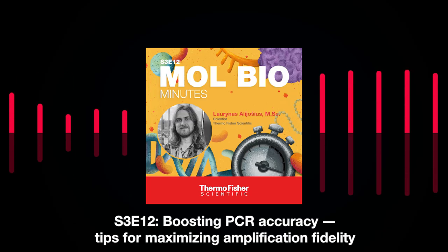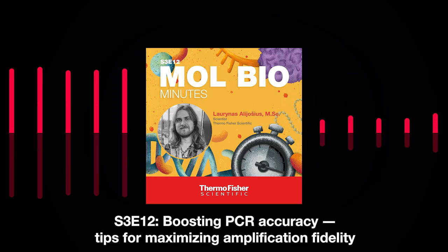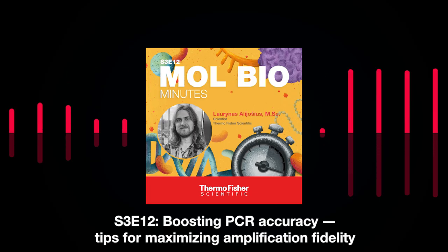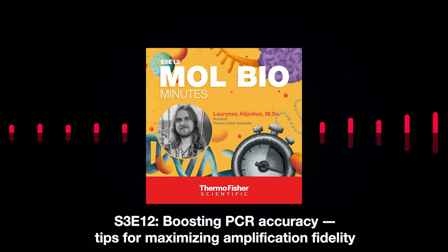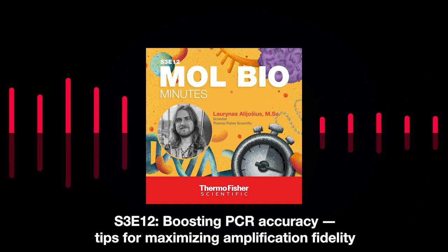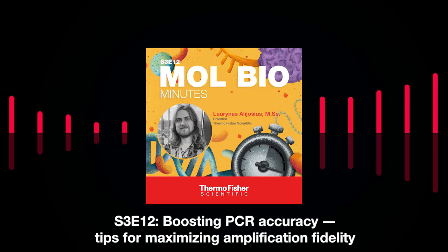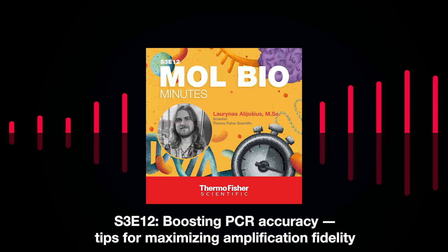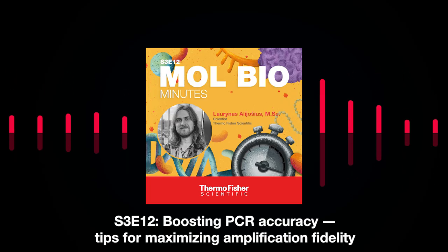As you can see, there are many factors that you can go into detail on that can affect the accuracy of your PCR. So, what can make the accuracy go low, right? But what can we do to improve all this? So the best is to address these factors one by one, in the same fashion that we talked about earlier. So let's say your DNA polymerase is a low fidelity type, or your polymerase doesn't have the proofreading activity that could fix errors.